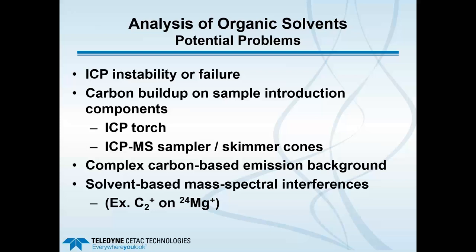When approaching volatile organic solvents with boiling points under 120 degrees C, there are a number of potential problems. These include ICP instability or failure, carbon buildup on sample introduction components such as the ICP torch and the ICP-MS sampler and skimmer cones. In addition, we can have complex carbon-based emission background, which can hinder lower detection limits, and in ICP-MS we can have solvent-based mass spectral interferences. One example is the carbon dimer C2+ at mass 24, giving an interference on magnesium-24, particularly when using quadrupole ICP-MS with unit mass resolution.